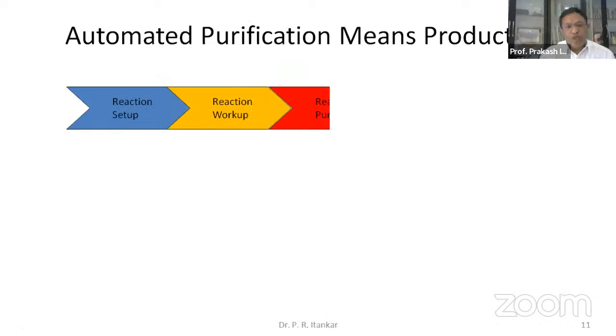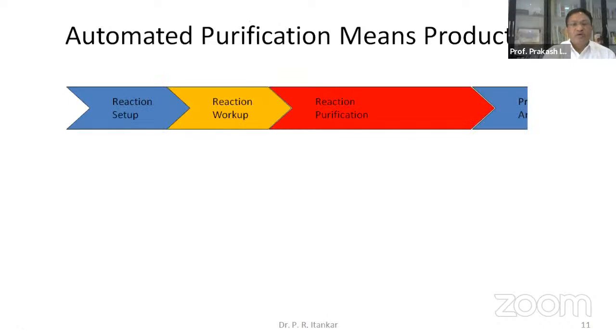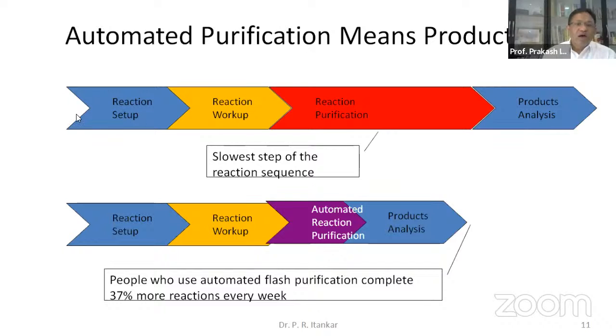Now, what was desired earlier was that, right from preparing our sample to the product analysis, the most time-consuming patch of your research is the purification step. As desired by all of us, machines have now come up, which we call flash chromatography, which has drastically reduced it. Almost 40% of your time is saved if you use this kind of system.